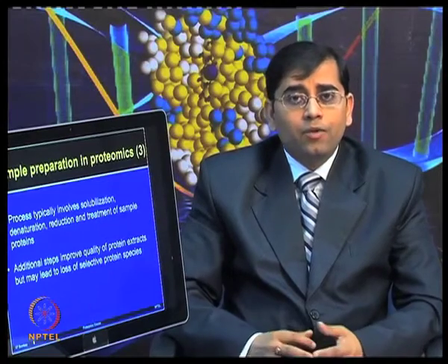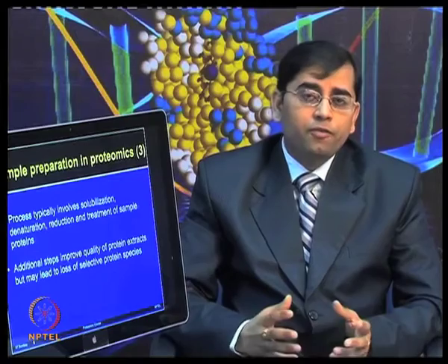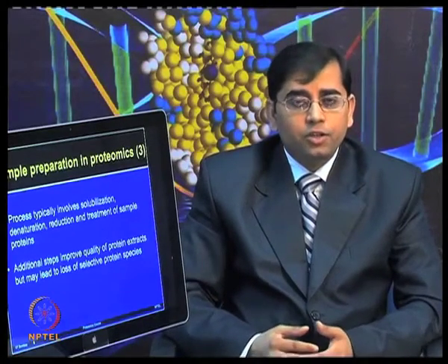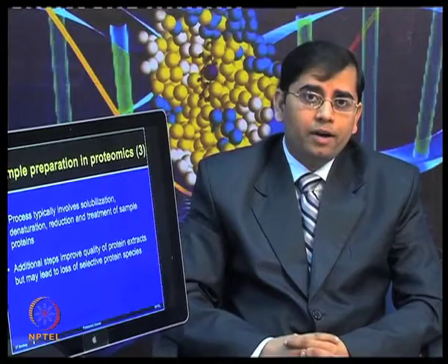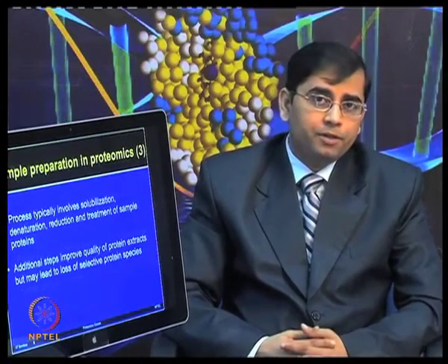And while you are doing this, you have to be very cautious that when you are performing various steps and sequential types of extraction, you may also lose a small fraction of the proteins. So, one has to be careful when adding various additional steps during sample preparation.